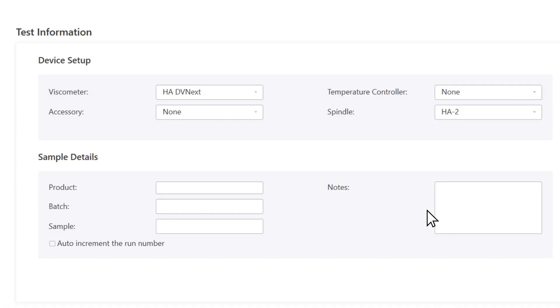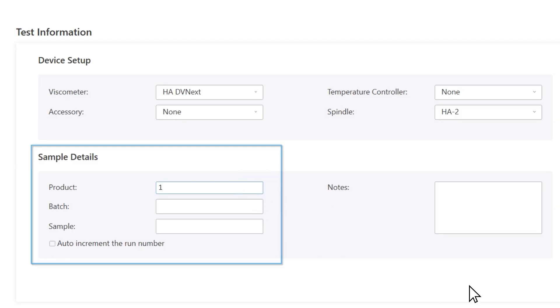Enter the sample information. In this case, it's Product 1, Batch 1, Sample 1.